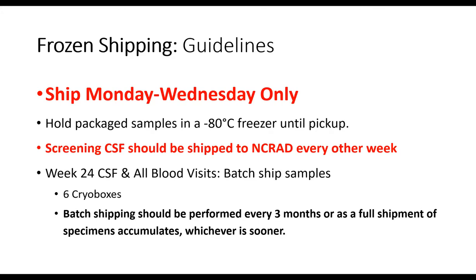And then all the other visits, the week 24 CSF and all the blood visits will be batch shipped together. So these shippers will have no more than 6 cryo boxes in them. And the combination of visits will kind of just depend on which time point it is, but it's 6 cryo boxes per shipper.